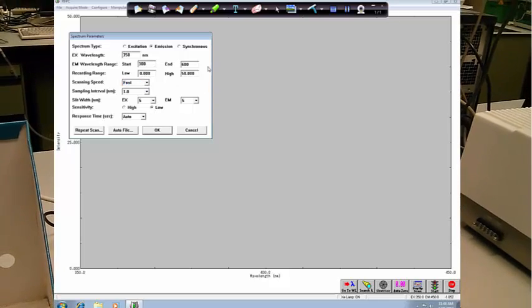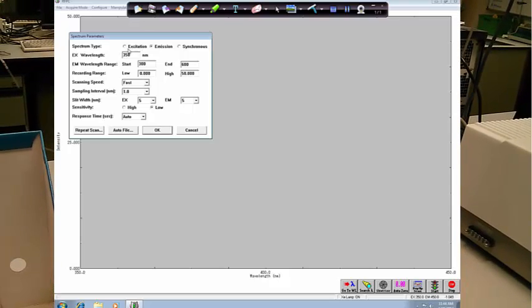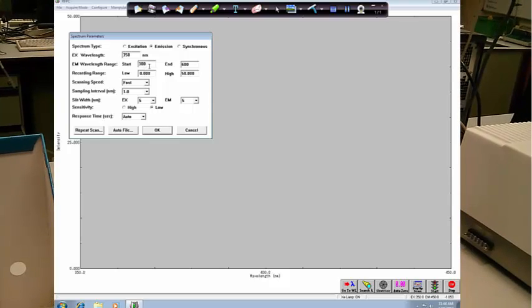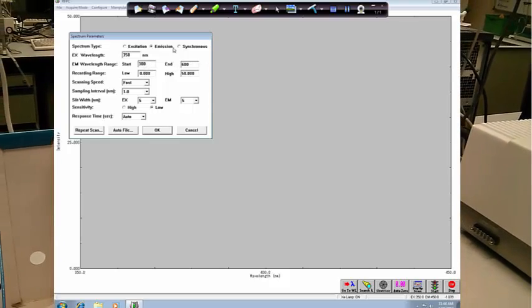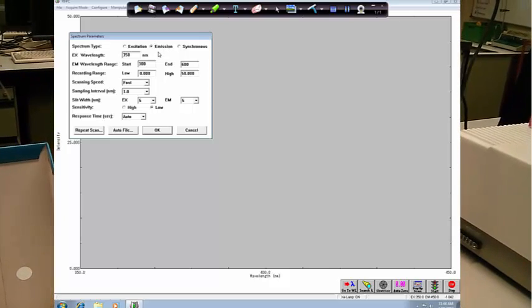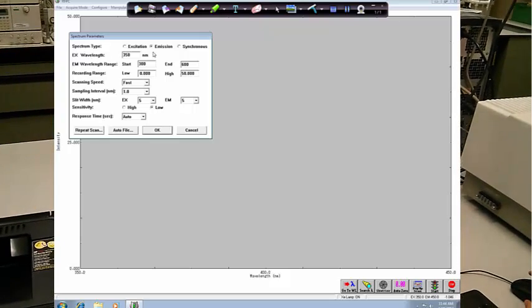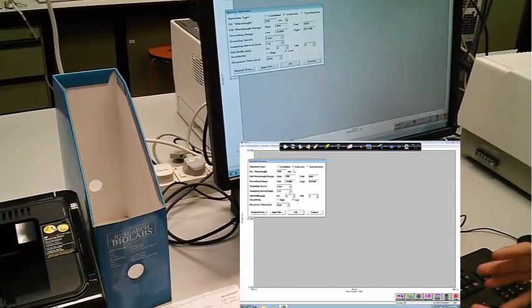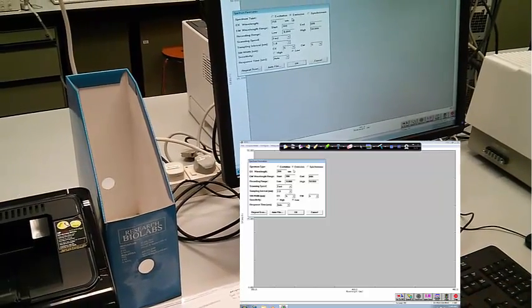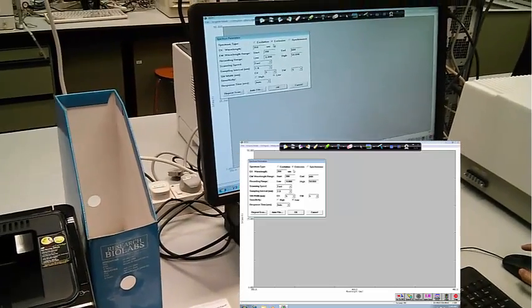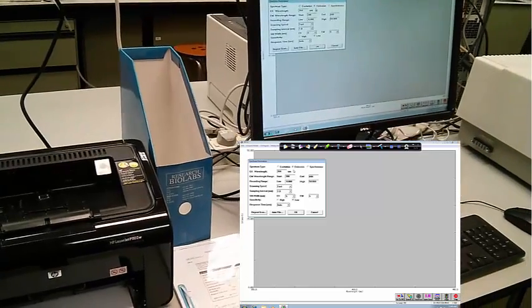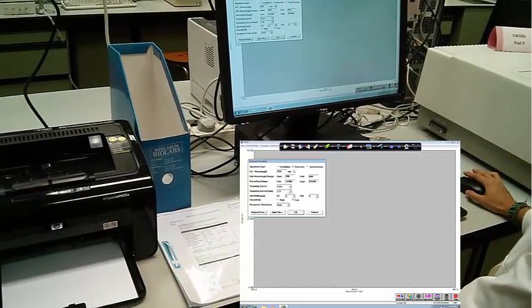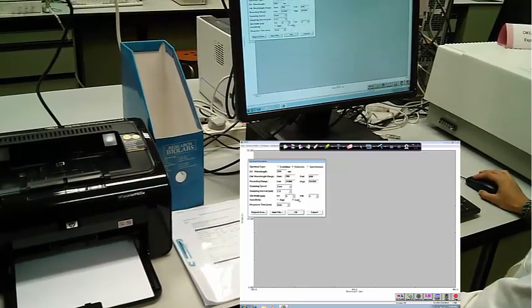Obviously these parameters will change throughout the practical. You'll need to take the excitation spectrum at some point as well as the emission spectrum. But for this one, we're just going to run this, so it's going to scan from a wavelength of 300 nanometers to 600 nanometers. The purpose of doing this initially, running the emission spectrum, is to find at what point our fluorescing molecule is actually emitting, so we can narrow down the wavelength and essentially save time and increase the absorption and the intensity of our peaks when we're actually running this sample. We'll do the parallel part on the excitation wavelength spectrum, so this is looking at the emission. The next part we look at the excitation, and in the same way, narrow it down to the most important wavelength to excite the molecule with.